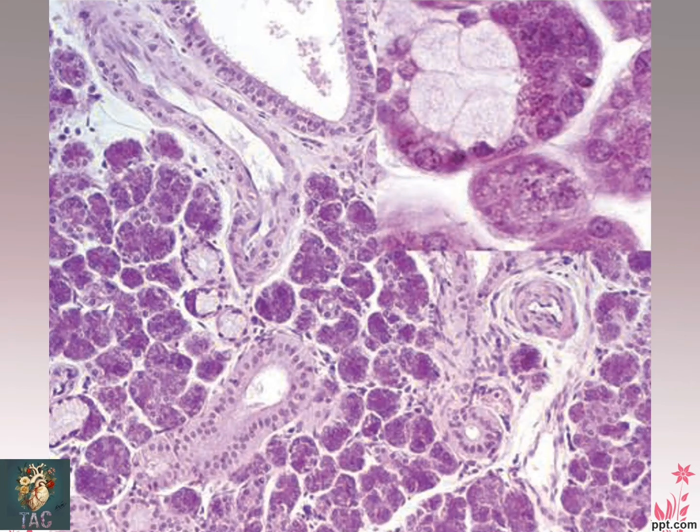Another beautiful slide taken from the salivary glands. Here you can see this is the larger size duct. You can clearly see the nuclei which are present at two levels, one which are present at the bases and others which are present at the surface, facing the lumen. So the surface cells, the cells which are facing the surface, are columnar in shape. They have basally elongated nuclei. So that's why this epithelium is given the name of stratified columnar epithelium. So this is again another slide from the salivary glands. This is the slide of stratified columnar epithelium.